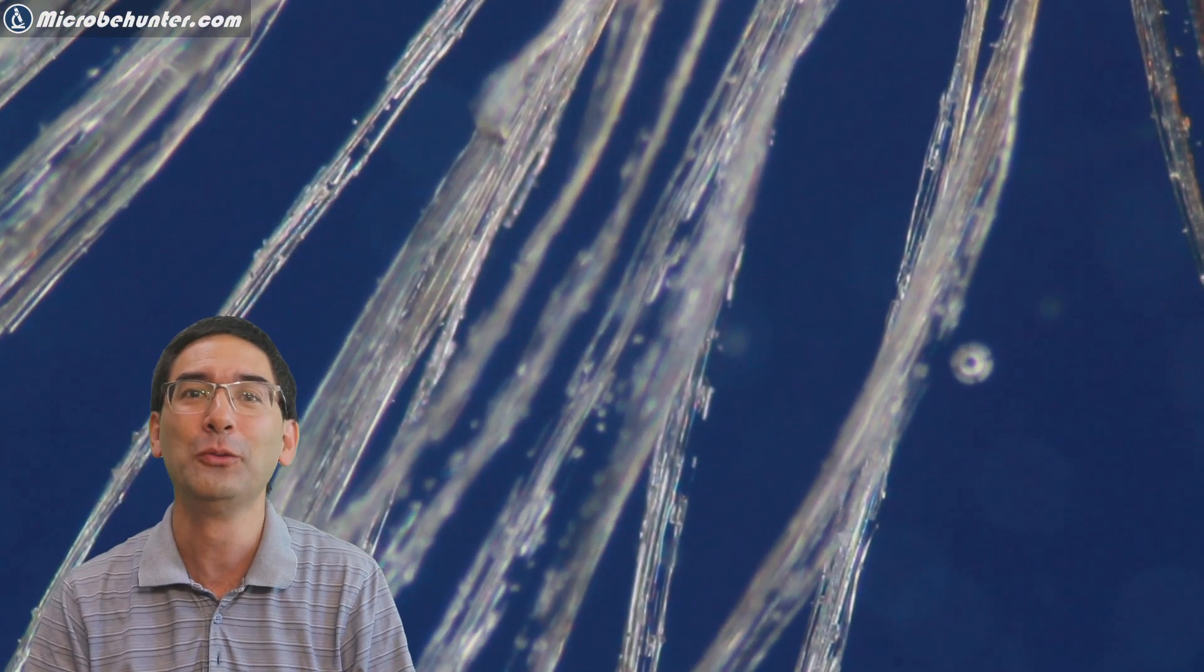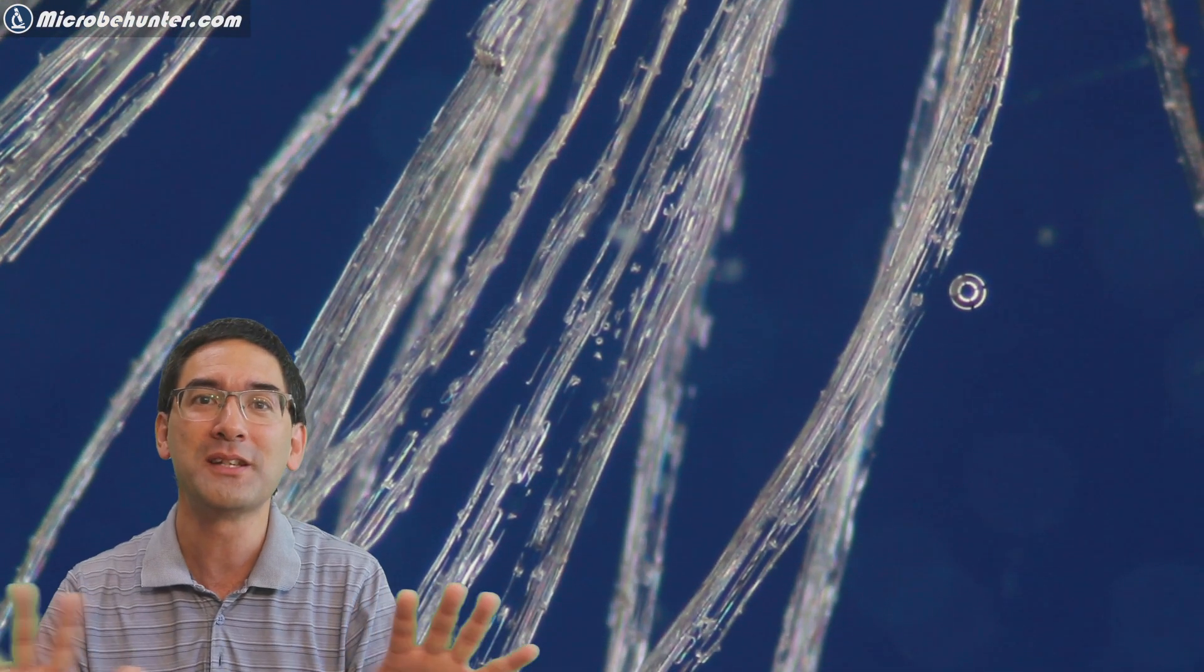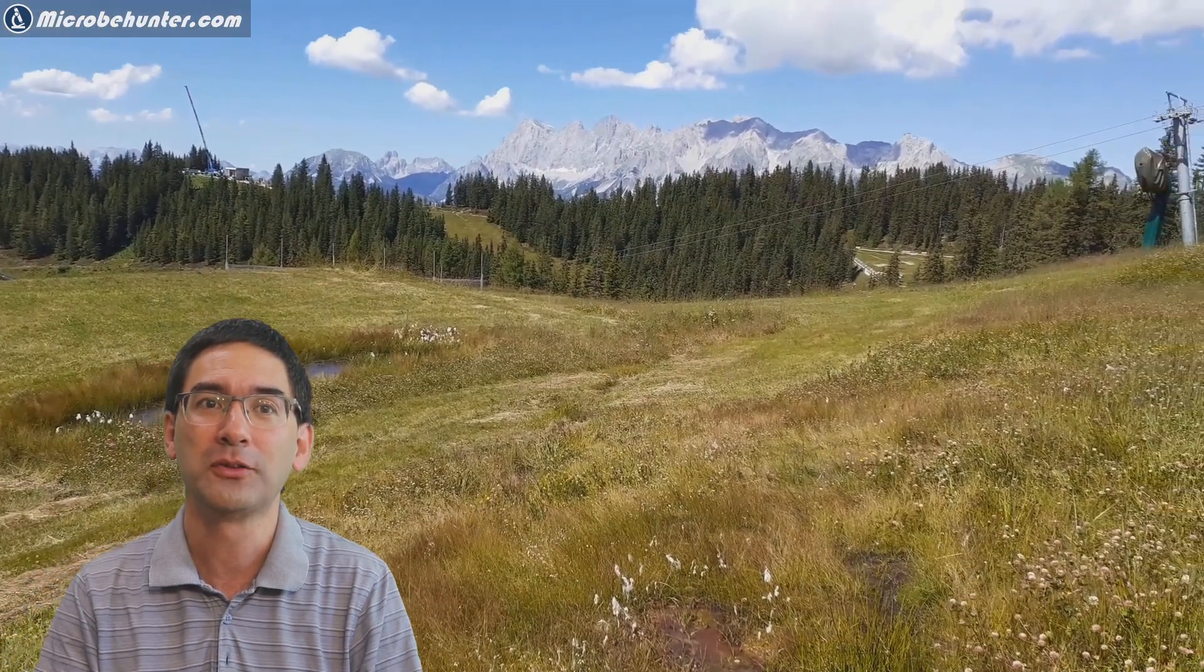By the way this is in Rheinberg illumination so you see that the background is slightly blue. That's because I used a blue filter here.